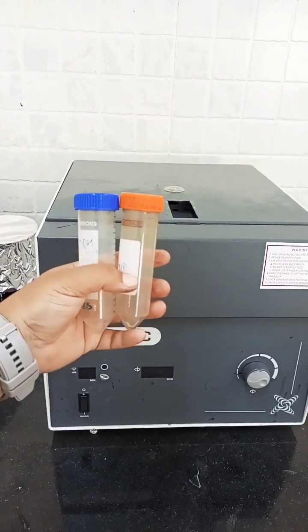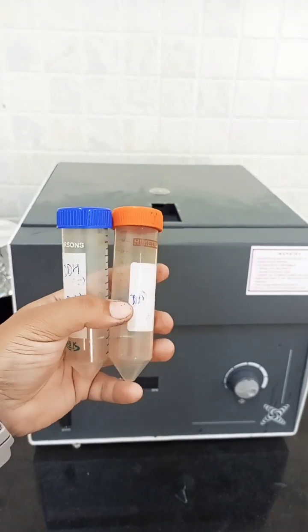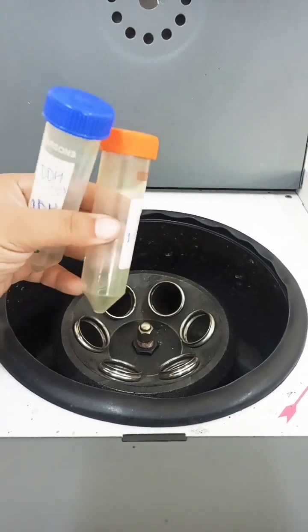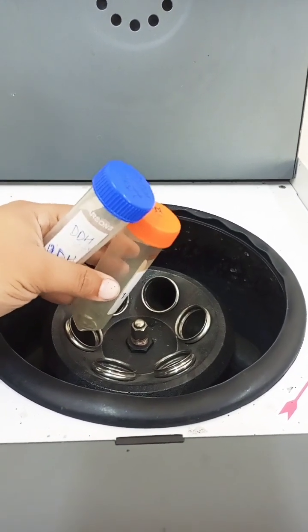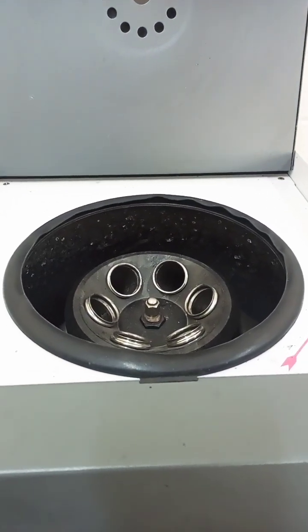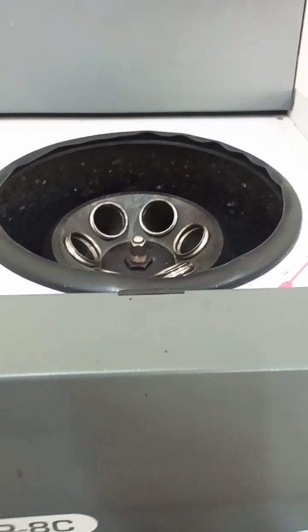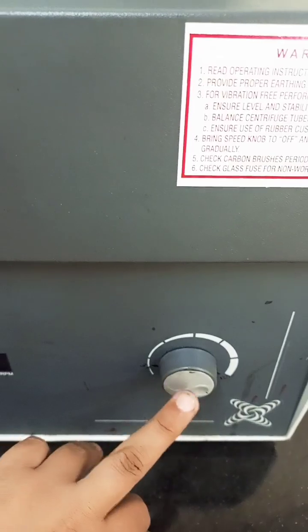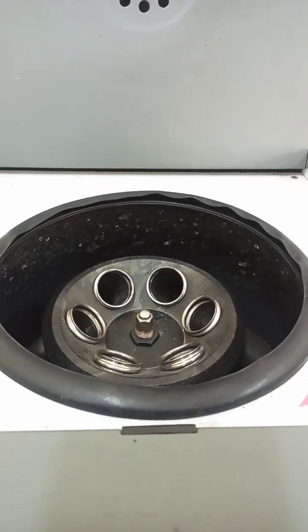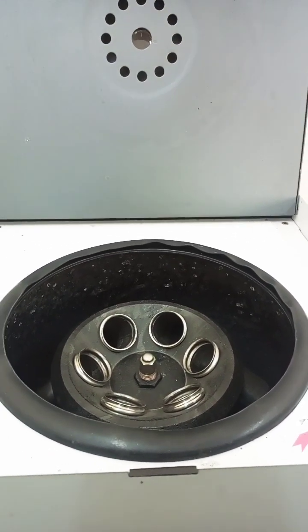These are the kinds of tubes which are usually placed into the centrifuge machine. We fill our solution into these tubes and they get fitted into the machine. The machine is then allowed to rotate at high RPM. It has a knob from where we can set the RPM and also set the timer — for how long we want to rotate our solution.